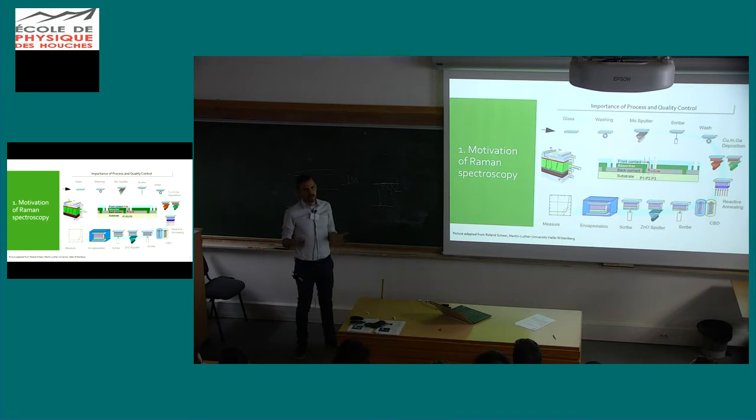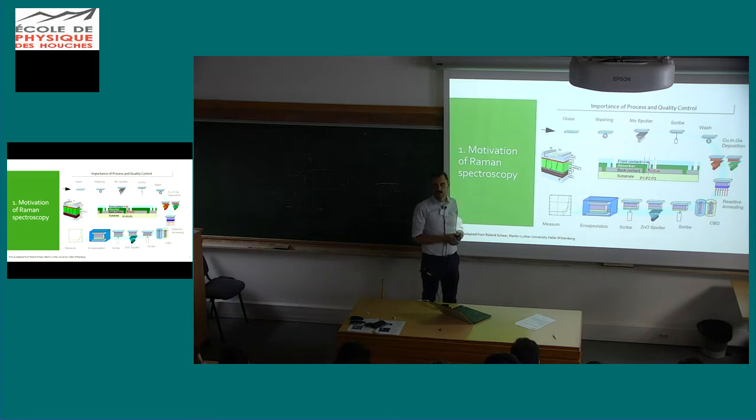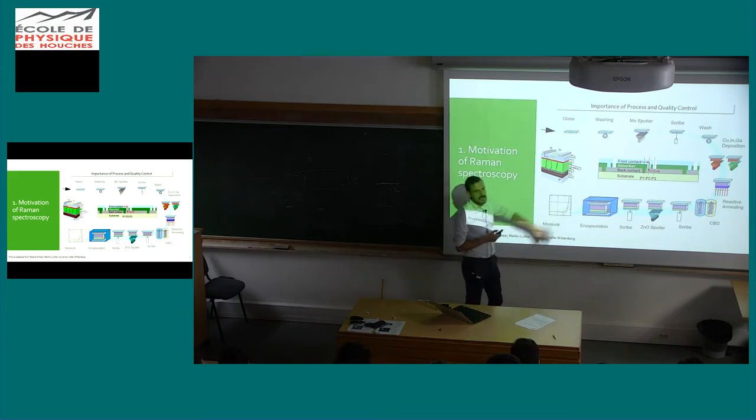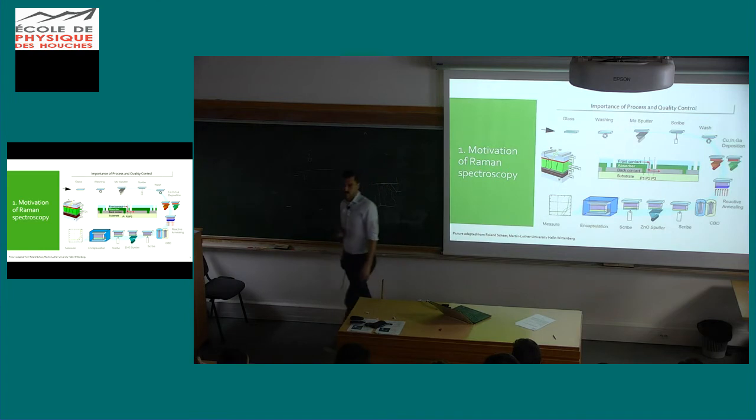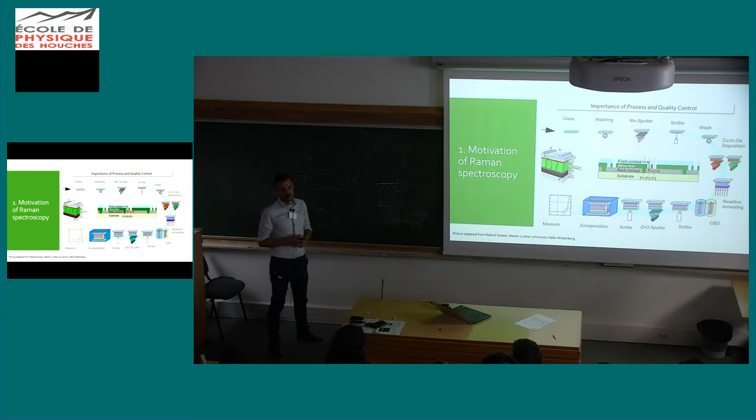But of course, before having this technology in hand for inline control and quality control at industry level, you need a lot of laboratory research in order to develop all the methodologies and parameters that you can use for characterizing your process.